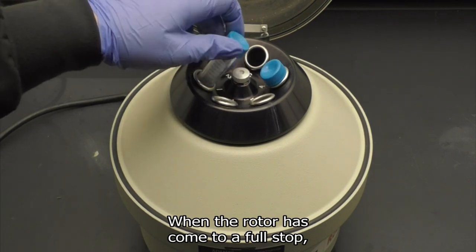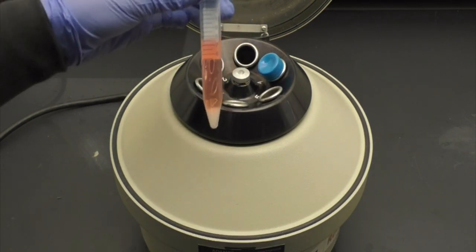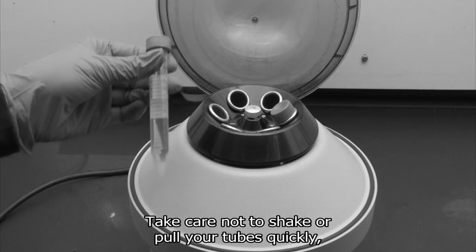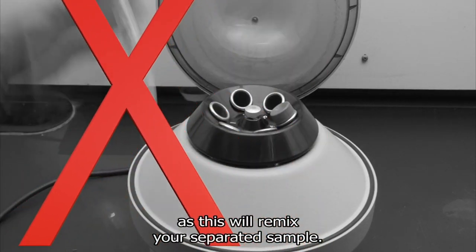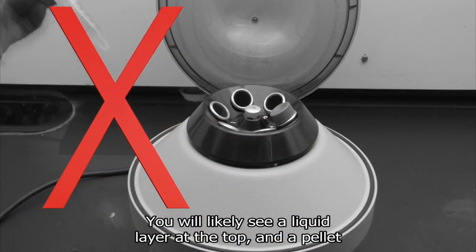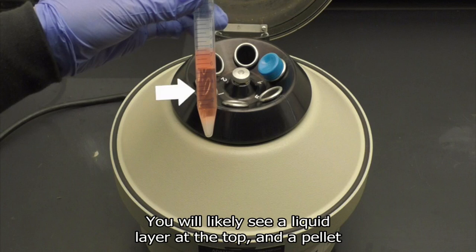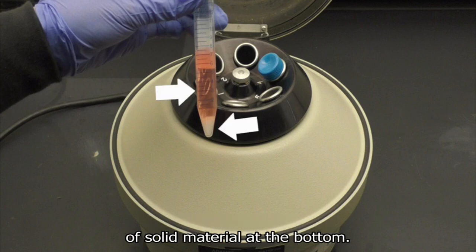When the rotor has come to a full stop, remove your samples carefully. Take care not to shake or pull your tubes quickly as this will remix your separated sample. You will likely see a liquid layer at the top and a pellet of solid material at the bottom.